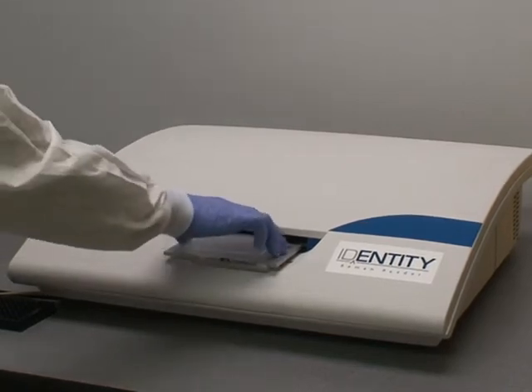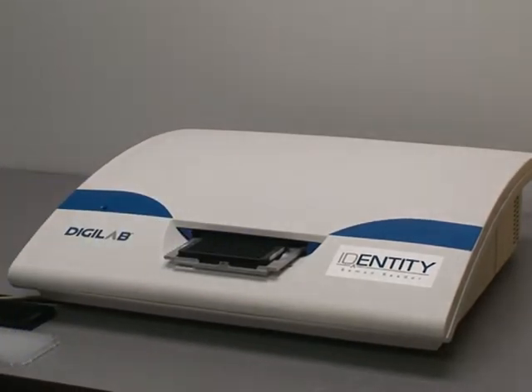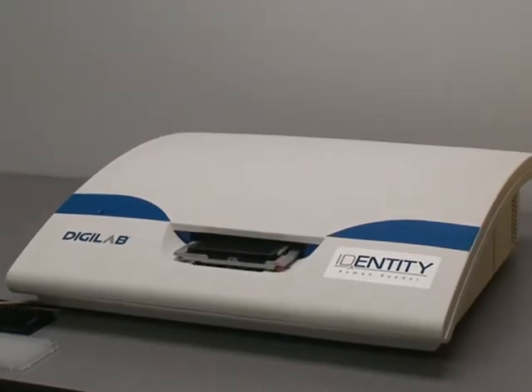In this video, we're talking about DigiLab's new Identity Raman-based microplate reader, which is designed to work with 96 and 384 well plates.